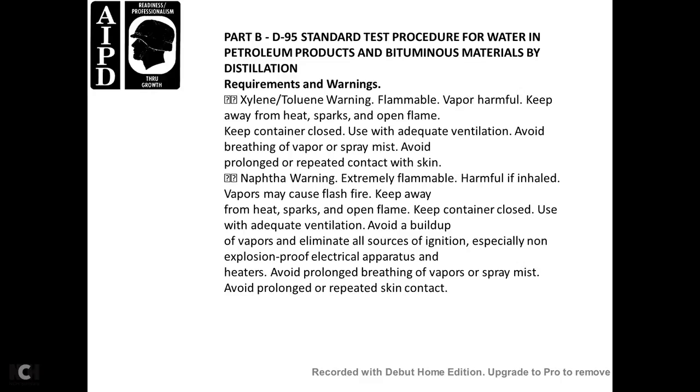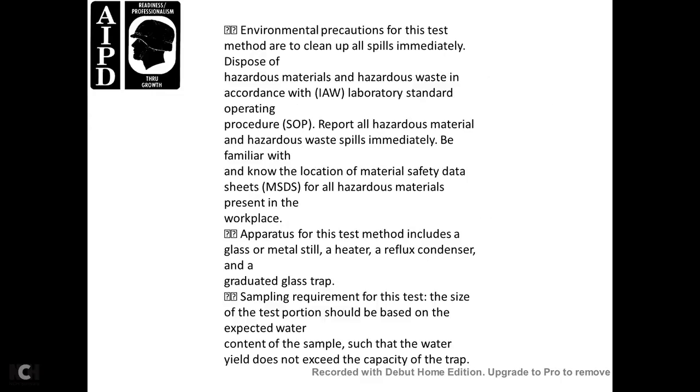Warning: extremely flammable, harmful. Inhaled vapors can cause a flash fire. Keep away from heat, sparks, and open flame. Keep container closed. Use adequate ventilation. Avoid buildup of vapors. Eliminate all sources of ignition, especially non-explosion-proof electrical apparatus and heaters. Avoid prolonged breathing of vapors and spray mist. Avoid prolonged or repeated skin contact.